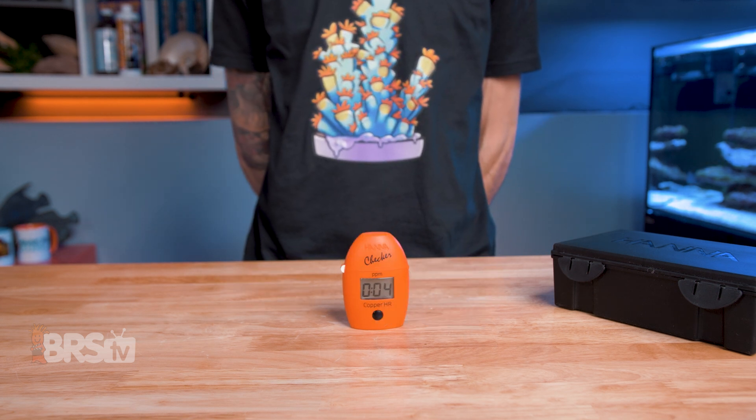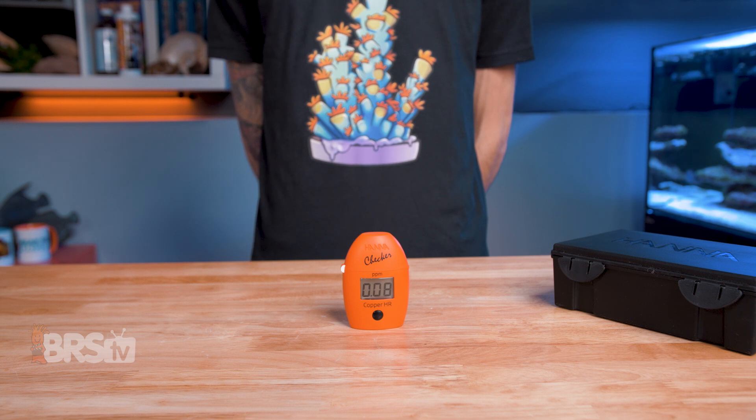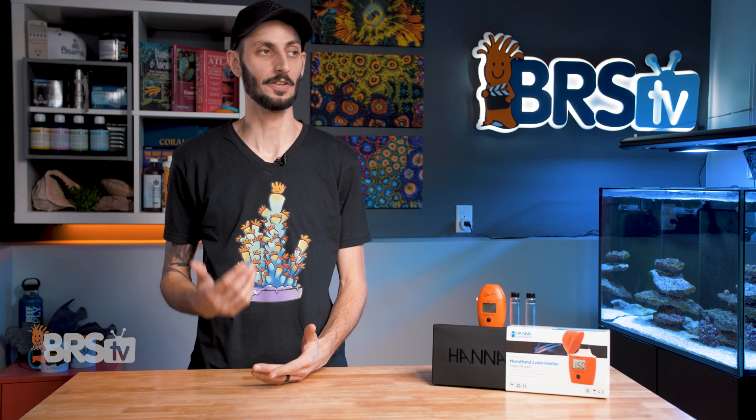After 45 seconds, the checker will automatically display the copper reading in PPM, and will automatically shut itself off after 10 minutes or when you press the button again. It is that simple. And after going through that test a couple of times, I've already got it memorized and I can do the test in under two minutes.